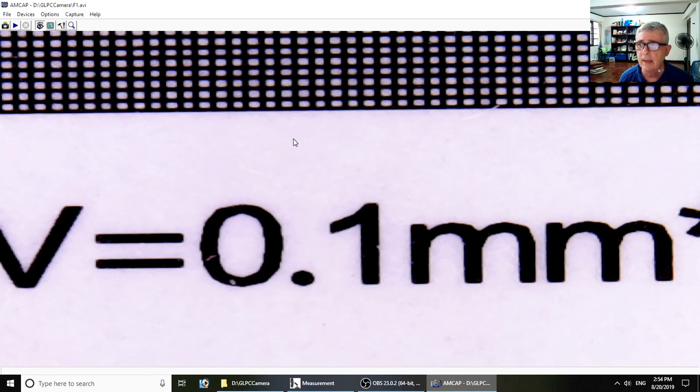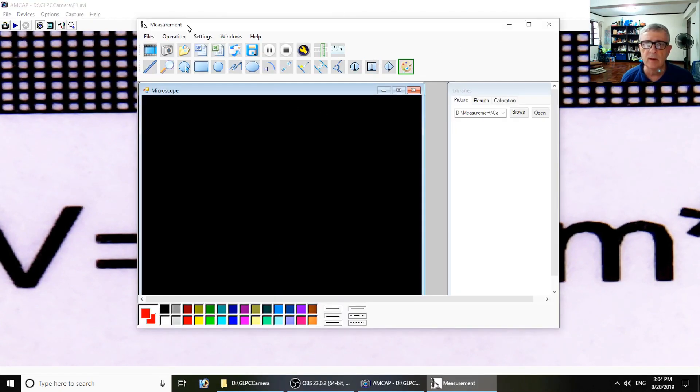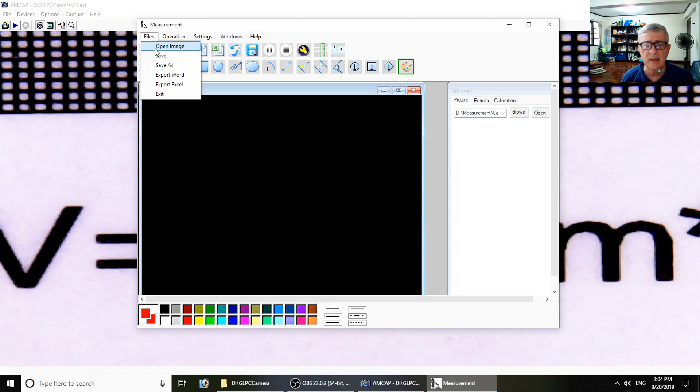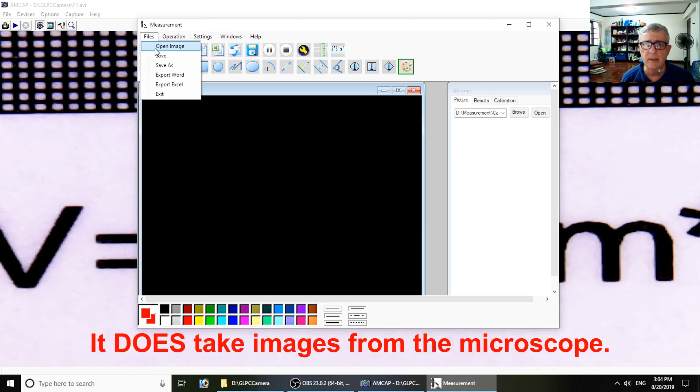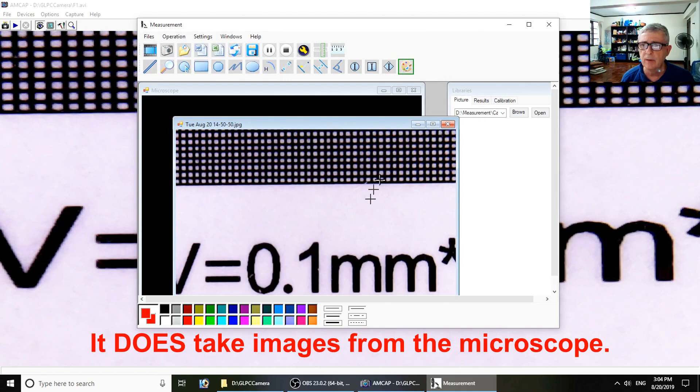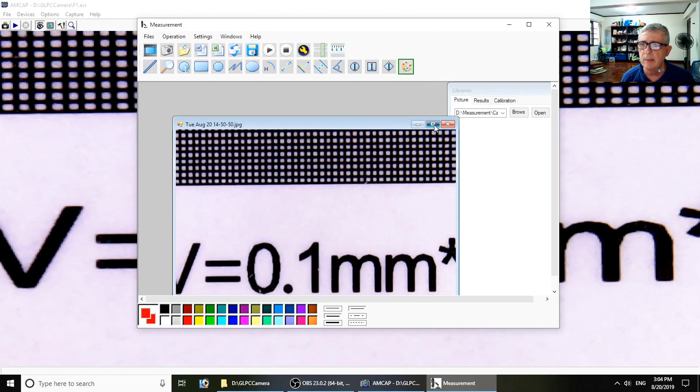The other piece of software they give you with this microscope is this thing called Measurement. It will work with images that are already recorded, as far as I can tell. It won't take them from the microscope itself, but it will allow you to take one that's been previously made.